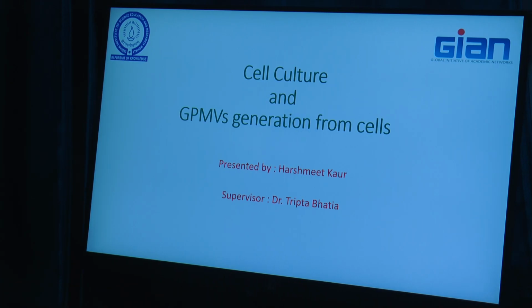Yesterday you learned how to prepare the artificial membranes. So today we'll jump from artificial to the biological cell. As the title of our workshop says, cells to synthetic biology, but in lab sessions we'll go in the opposite way, synthetic biology to cells.